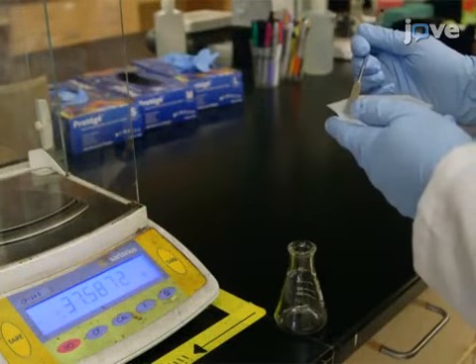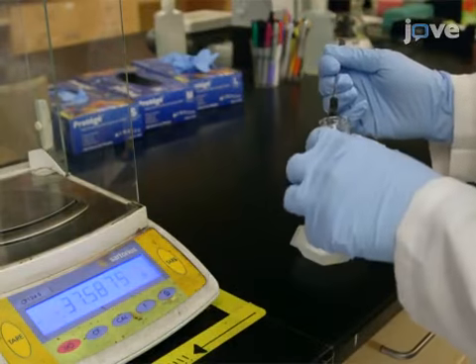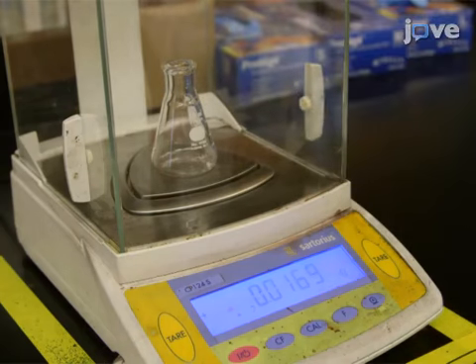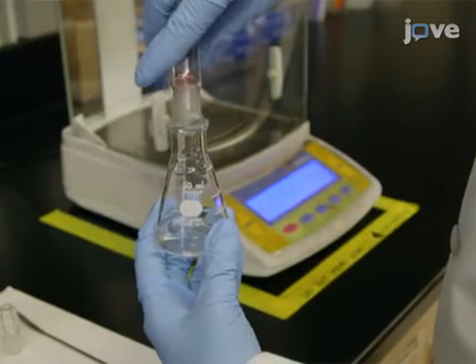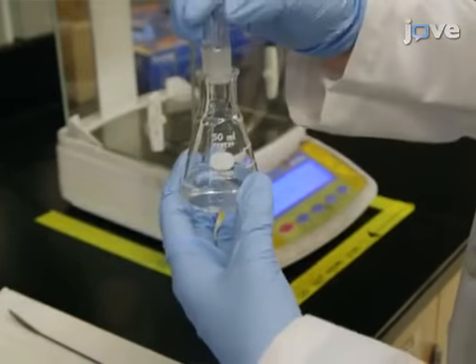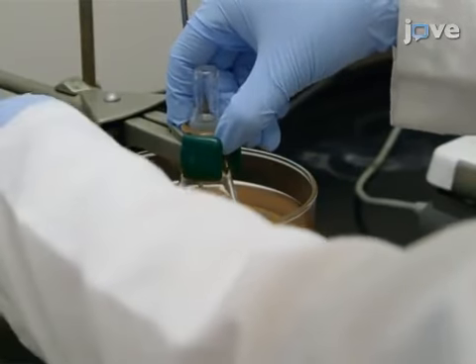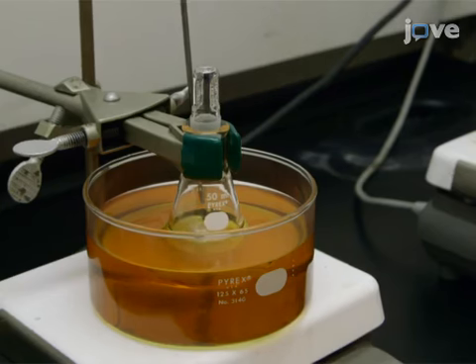To start the procedure, first weigh out 16.9 milligrams of silver nitrate into a 50-milliliter Erlenmeyer flask equipped with a magnetic stir bar. Add 20 milliliters of 18.2 mega-ohm ultra-pure water to the flask and stopper it. Place the flask in an oil bath on a hot plate at 60 degrees Celsius and stir the solution.